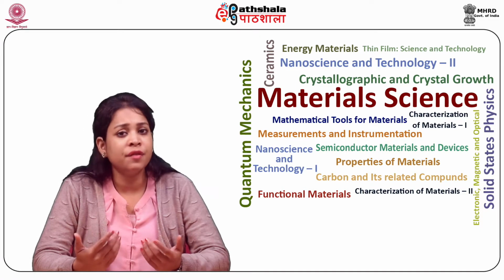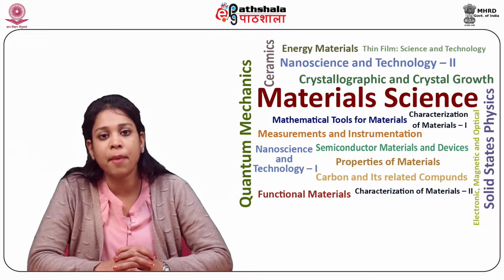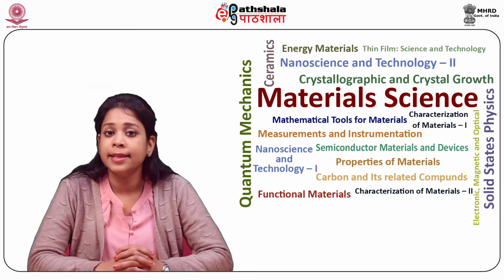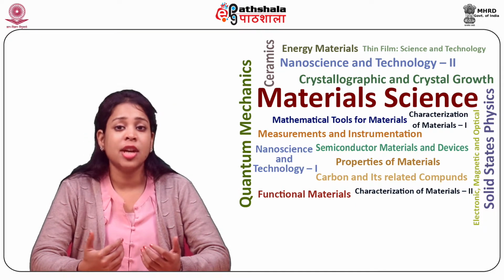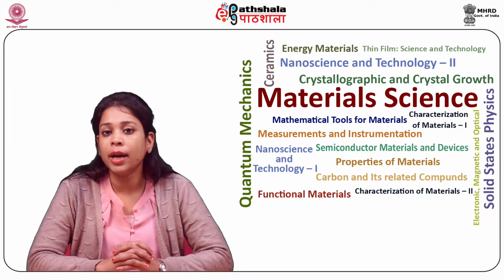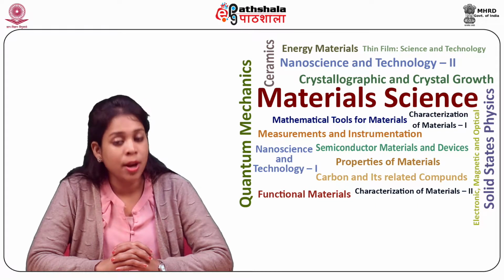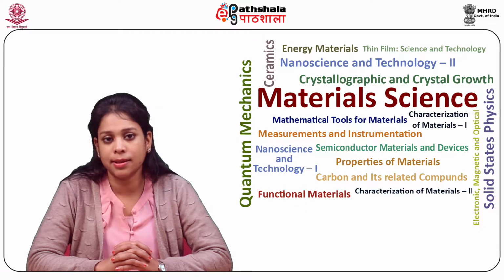In the past 50 years, NMR, that is nuclear magnetic resonance, has developed along with other technical advancements such as highly efficient computers capable of quick Fourier transform, efficient spectrometer control, and stable high field superconducting magnets.